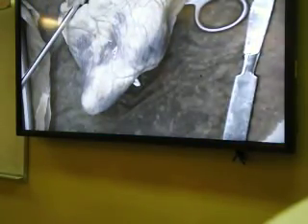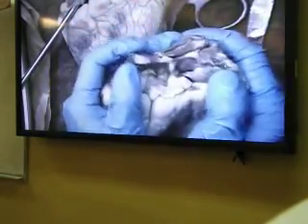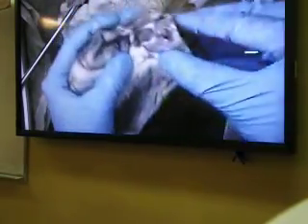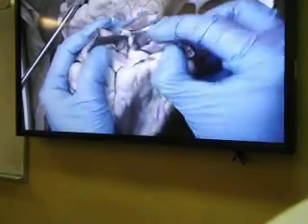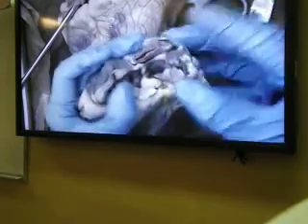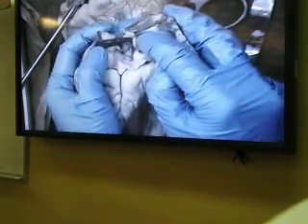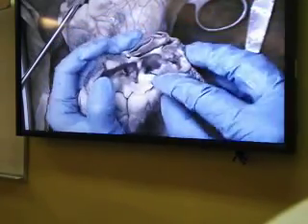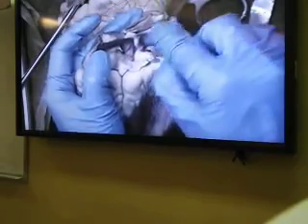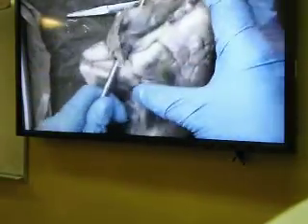And you may have one more type where the superior and inferior vena cava have been completely cut off. So this is the posterior aspect, right atrium, but you see there's actually nothing much. So this part is where the superior vena cava has to be, and this is the area where the inferior vena cava has to be, and it has been completely cut off. So those are the three different types of heart that you can see. Alright.